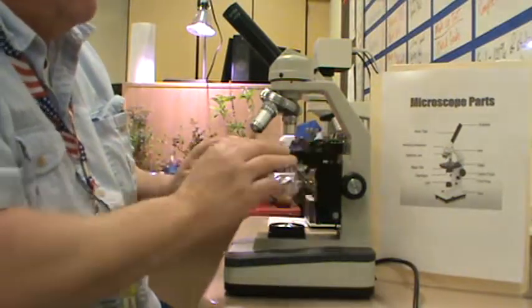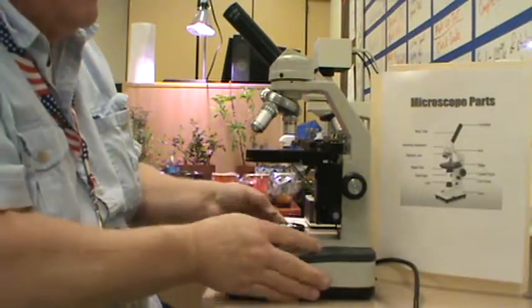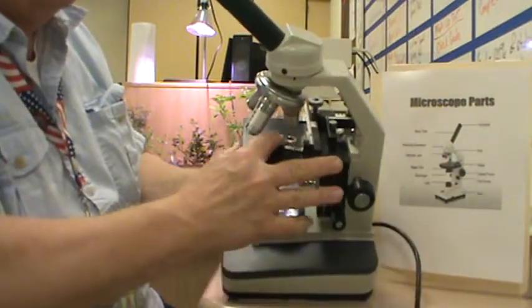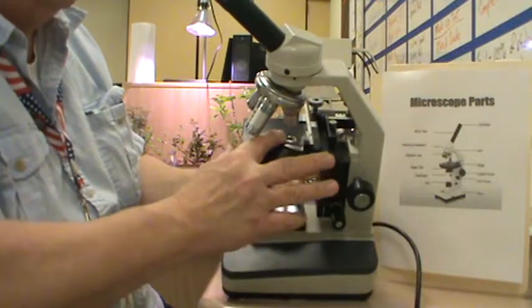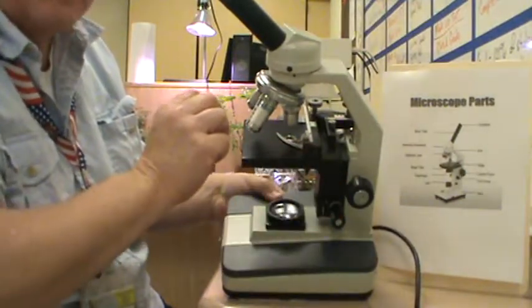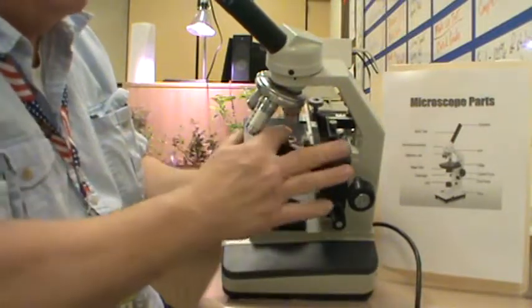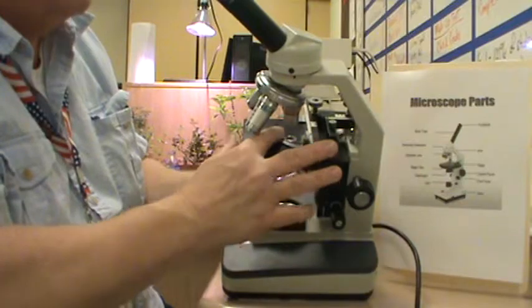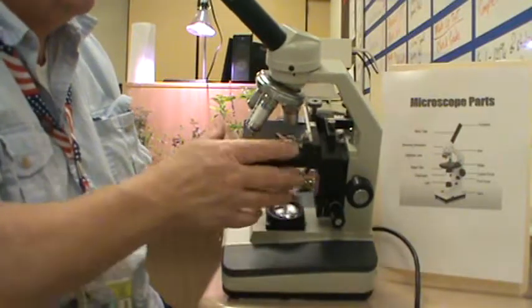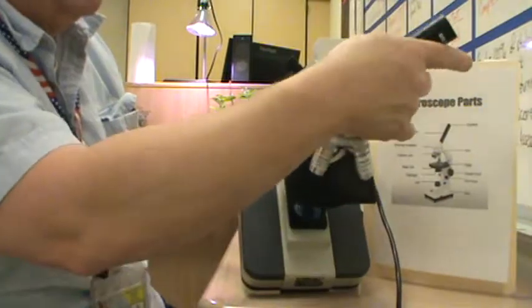We have the stage of the microscope. That's this flat area here. On the stage of the microscope, and I'll turn this sideways so you can see, we have a stage clip. Now, in older microscopes, there are actual clips that you would slide the slide under, and you would put the clips over the top. Ours happen to have this handy-dandy little holder here for putting your slides in. And I'll put this in and move that kind of out of the way.